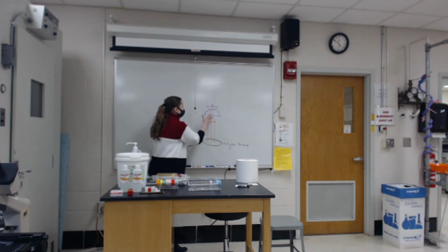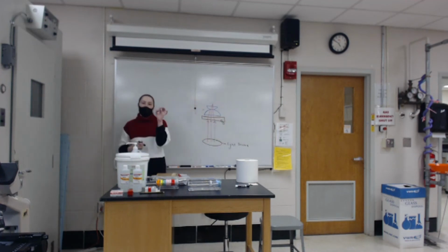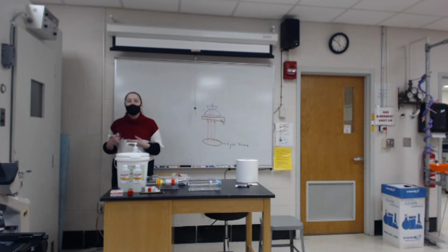In between the light source and the condenser, we have a tool called the iris diaphragm. This is an aperture that allows us to control the amount of light hitting the sample. As we increase magnification, the amount of light actually going through the lenses decreases, because, as we'll see later on, the beams of light will refract. At higher and higher magnifications, less light is going to enter the pipe that composes the objective lens. Because of this, as we increase magnification, we have to open the iris diaphragm more and more to see the sample effectively and have a good amount of contrast between the background and the sample itself.